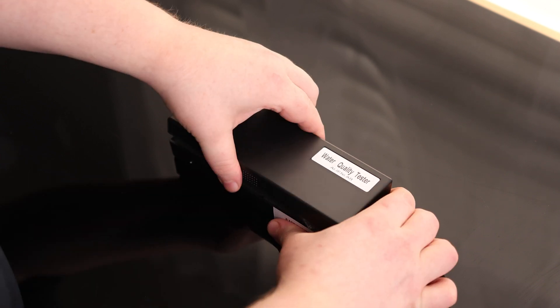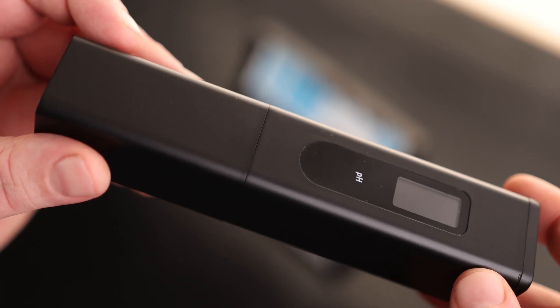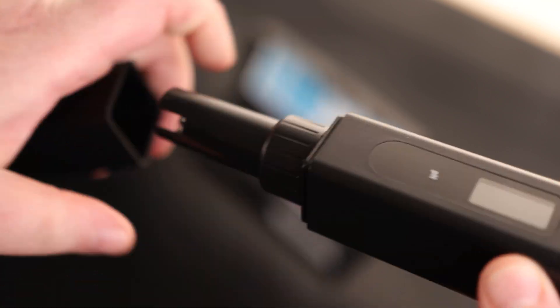All right, let's take a look at the Water Quality Tester. So this is the tester. We can see we can pull it apart, and we have all of our test probes there at the bottom.